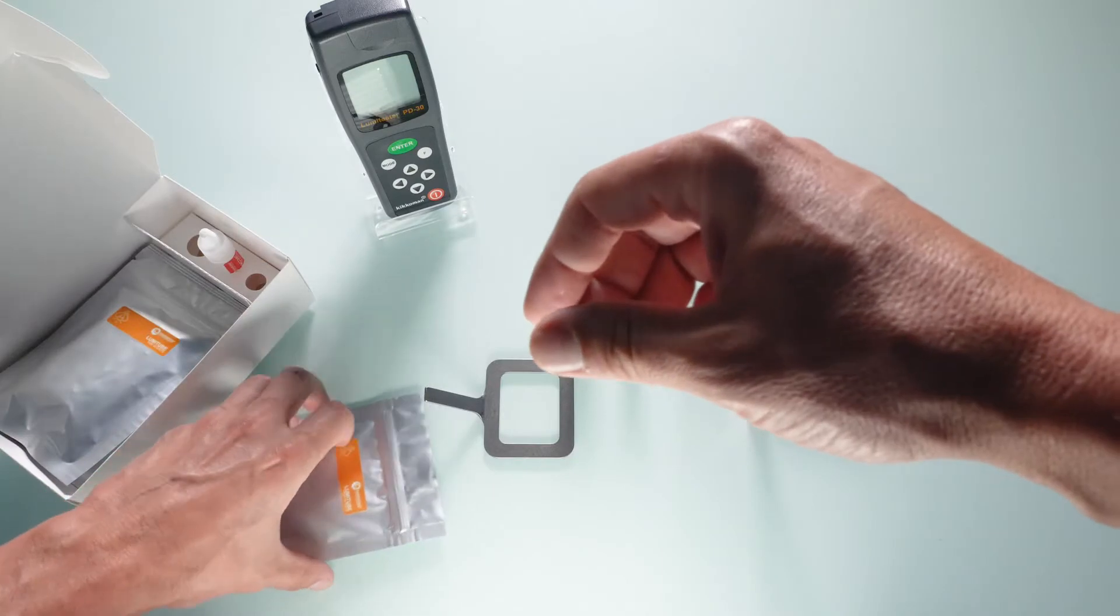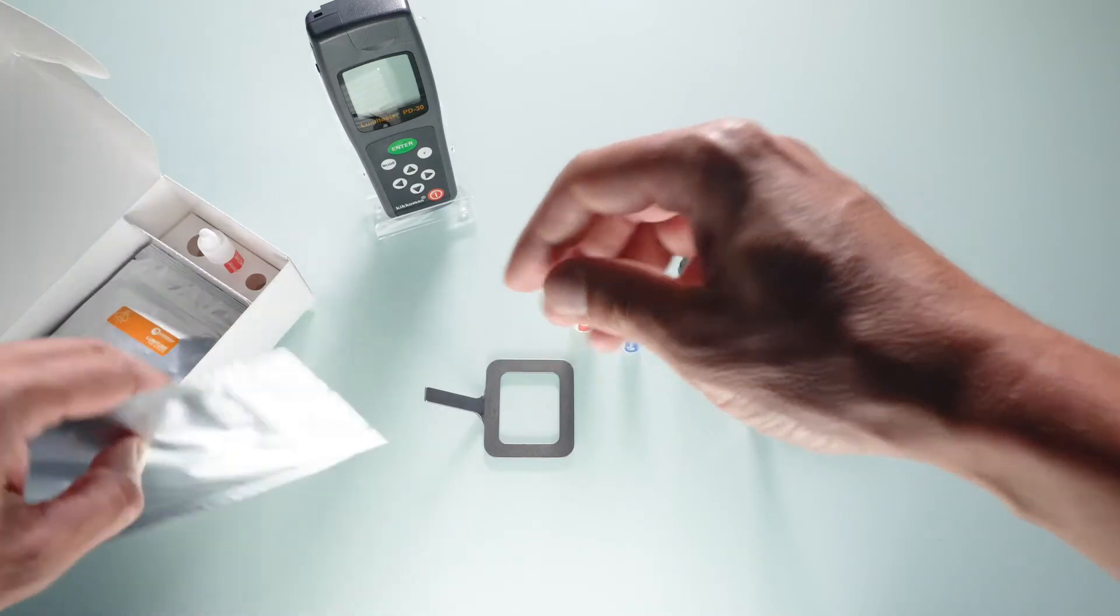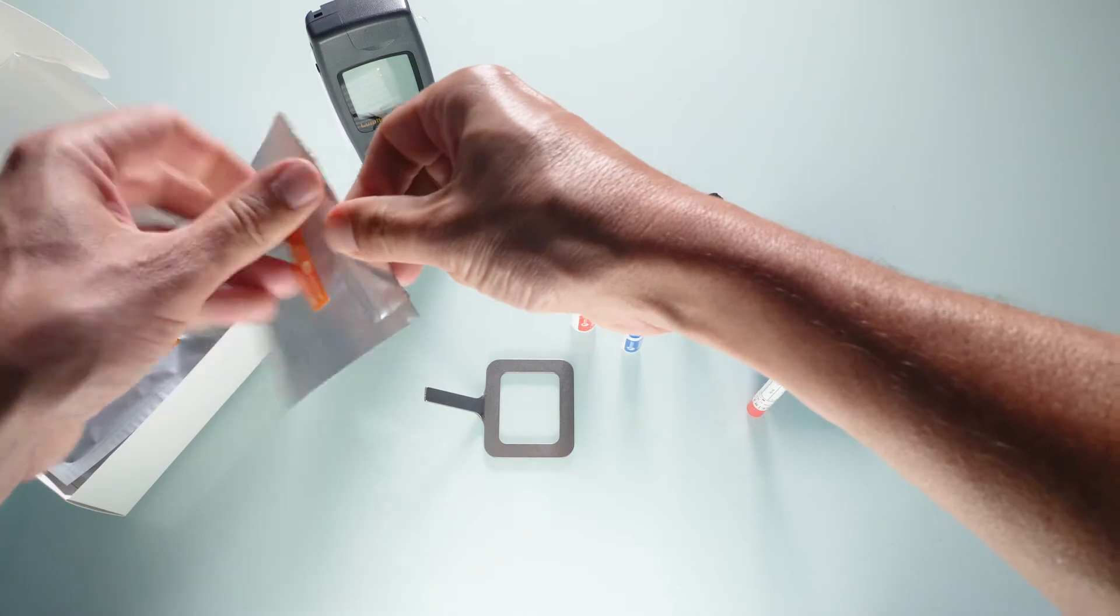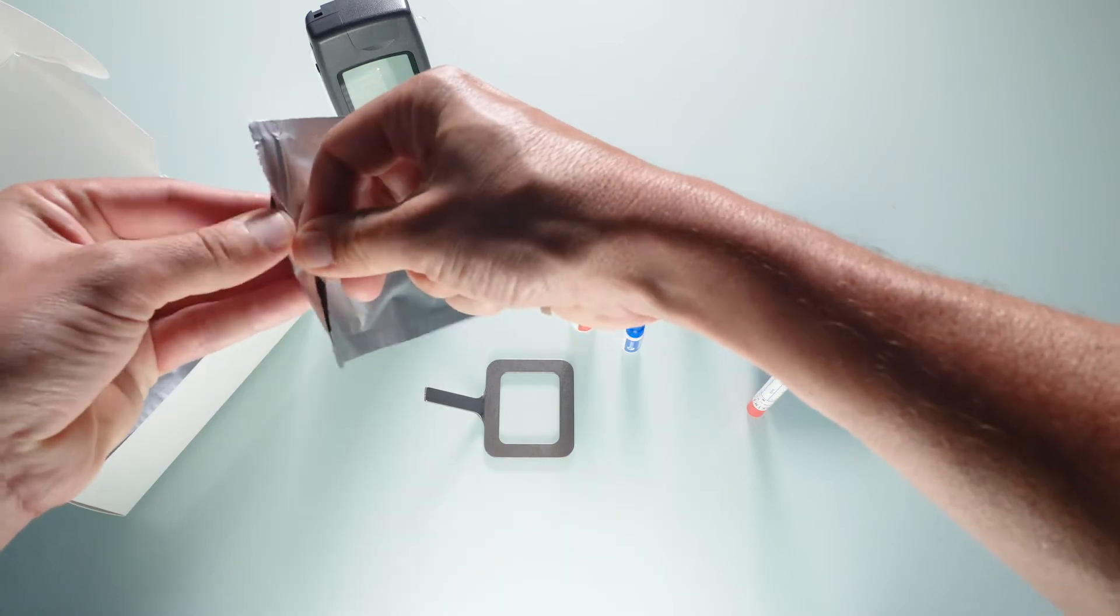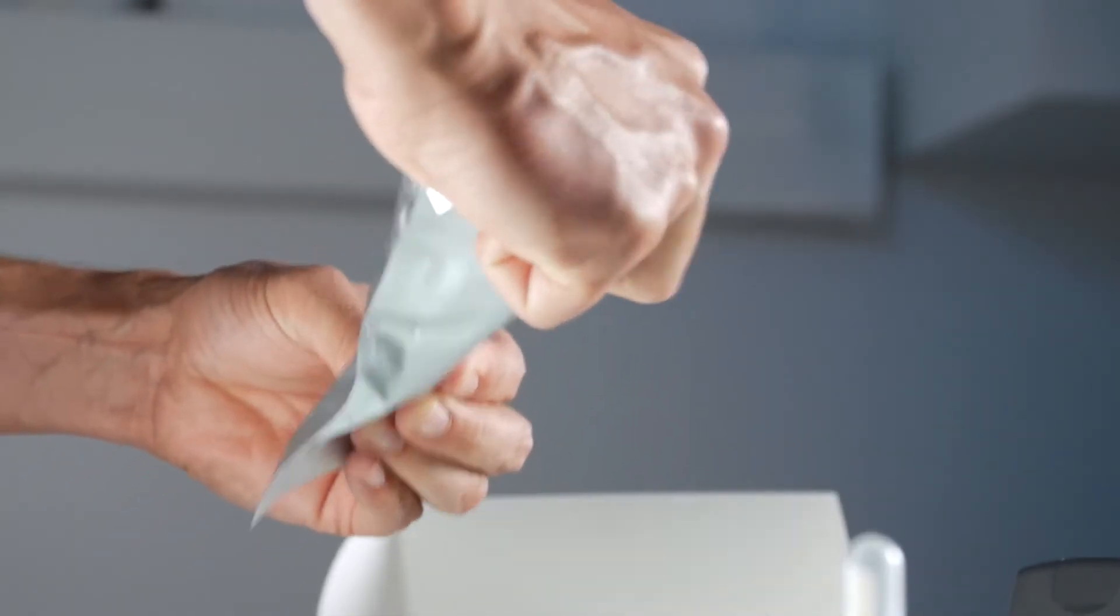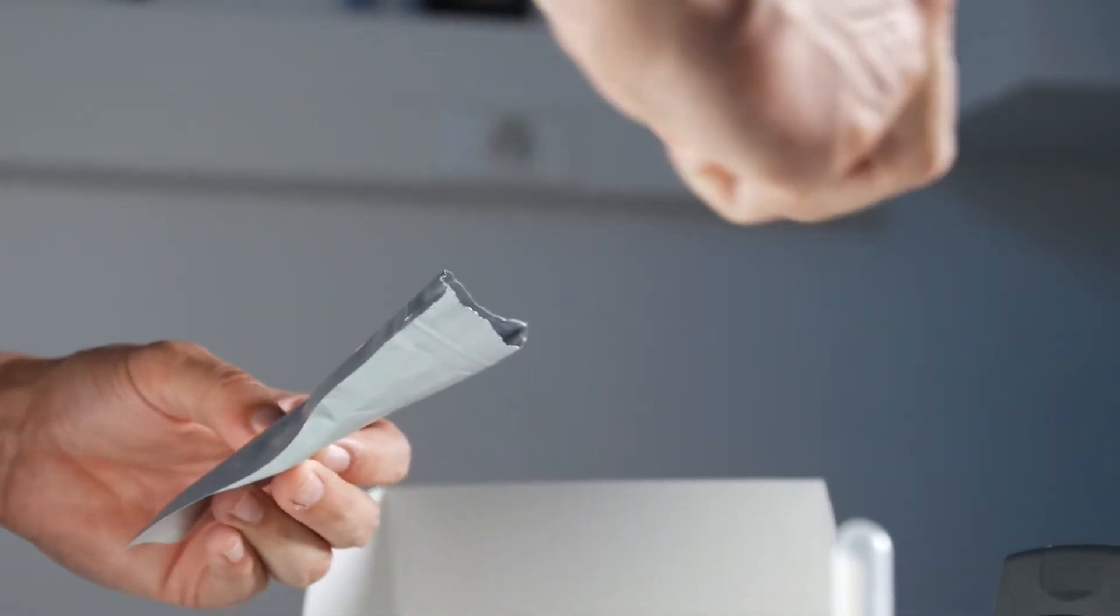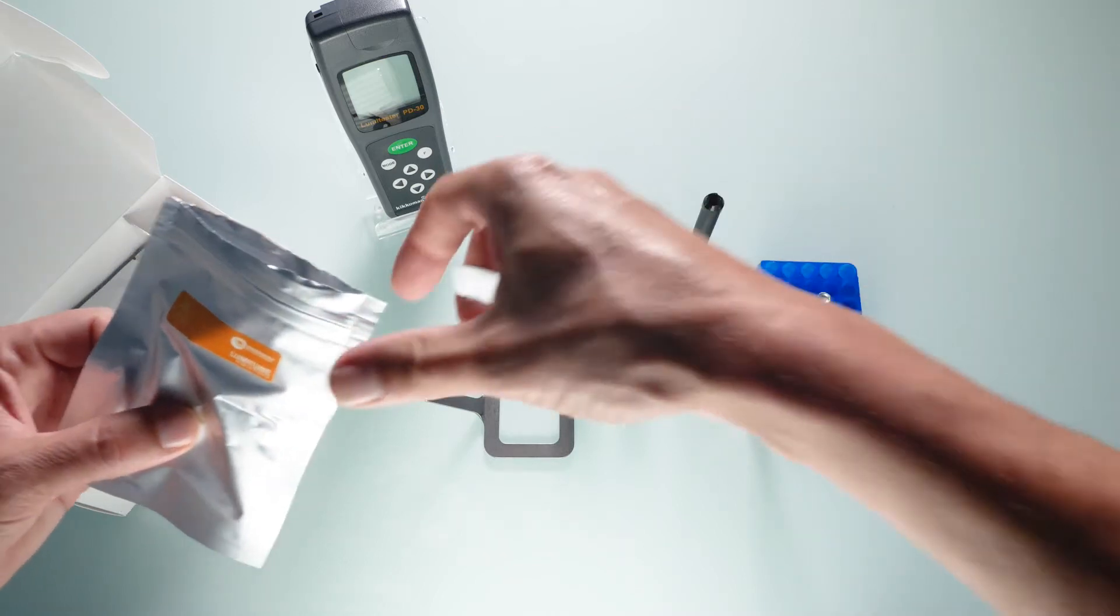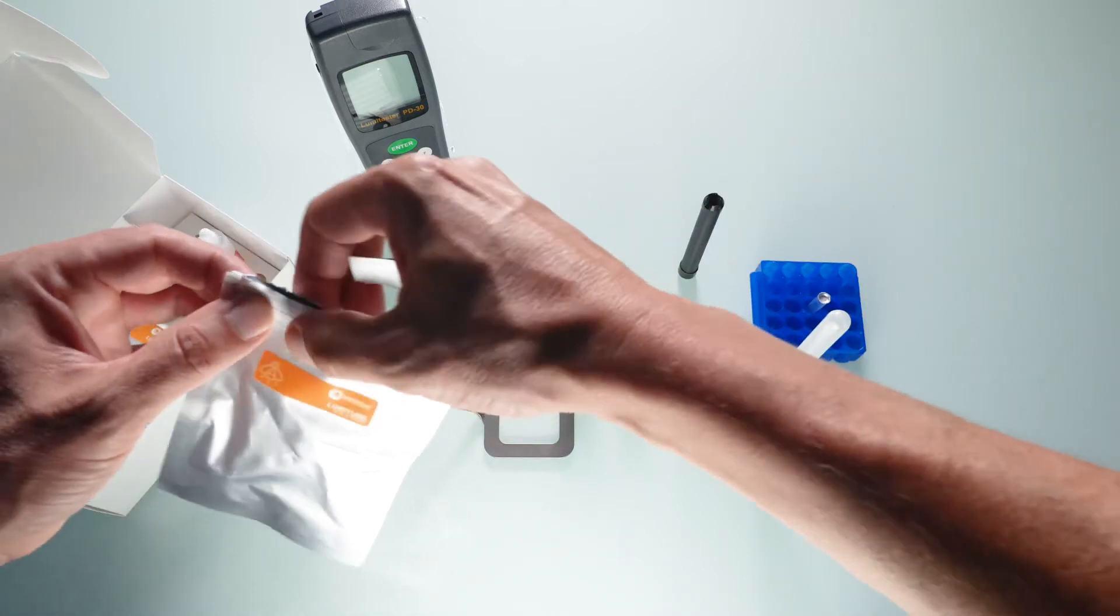Open the LumiTube's pouch and remove one tube. The tube contains a small white tablet containing enzymatic compounds. Put the tube in the rack and ensure that you firmly reseal the pouch.